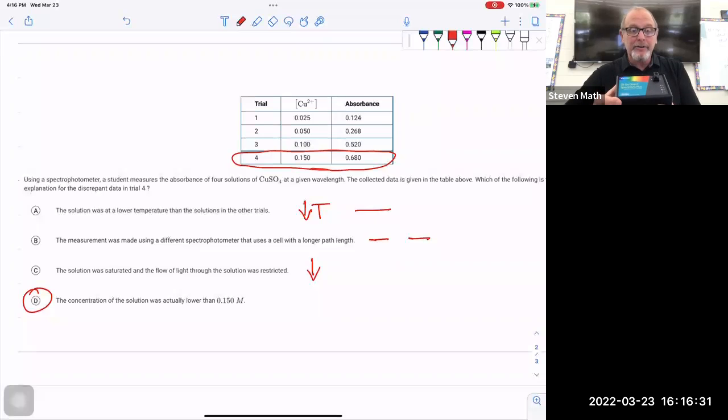And in the end, when it does so, we can use a standard curve to get concentrations and use those concentrations to figure out unknowns. I think that's all we need to know about Beer-Lambert law. It may show up for one question, it may not, but I'm Smath. I've given you a brief 20-minute rundown on it, and I hope this video helped.